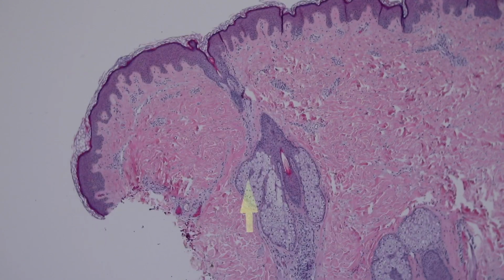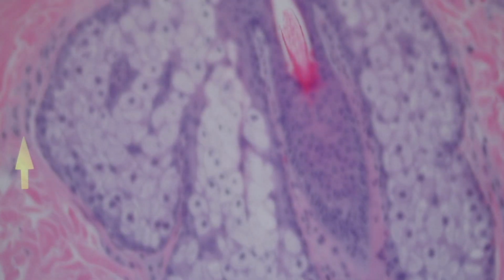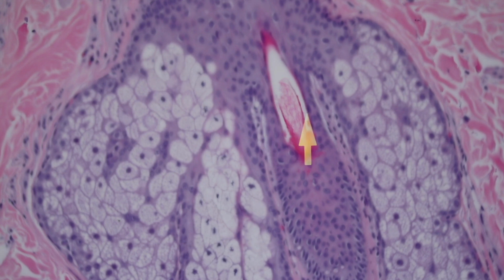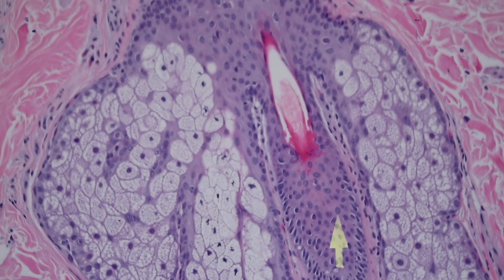So you have to get kind of used to looking at pieces of things that aren't always perfectly showing the entire detail. But here you can see kind of the base of one of these hair follicles, and in the center, this little piece right here, that if you kind of put your finger underneath the light, you can kind of see it move in and out. That is actually the hair shaft. That's what your hair looks like inside your skin. And the follicle is this layer of epithelium surrounding the hair shaft.